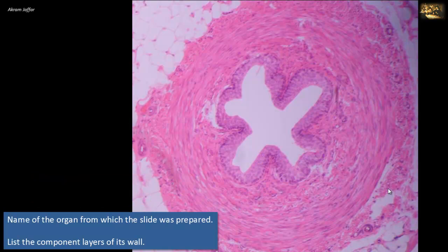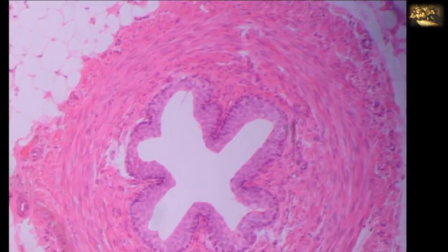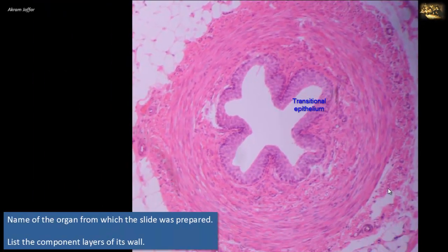Name the organ from which the slide was prepared and list the component layers of its wall. This slide clearly shows a muscular tube. The lining epithelium is transitional epithelium consisting of multiple cell layers. The presence of transitional epithelium confirms that the structure belongs to the urinary passages, which are exclusively lined by transitional epithelium — also called urothelium. The mucosa is thrown into folds in the relaxed state, allowing the tube to dilate during passage of urine. The tube is the ureter.